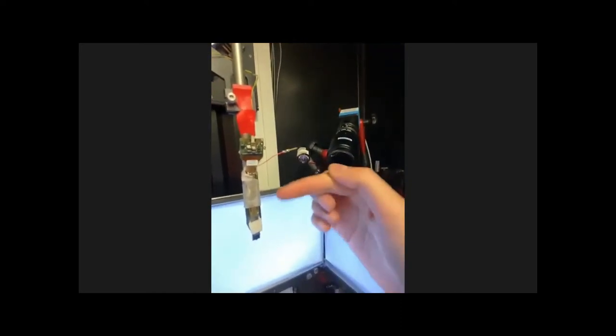You have a NeuroPixel probe, and you can see the shank here, and then you can see what is called the base, basically the chip, and then a flex cable.